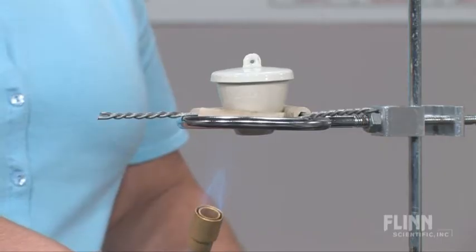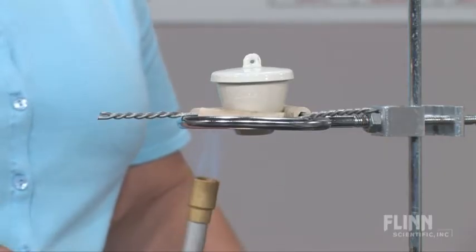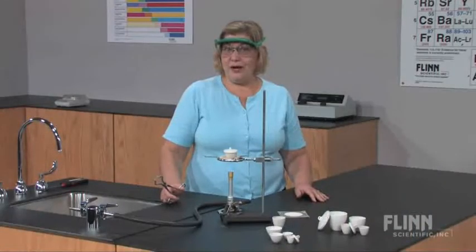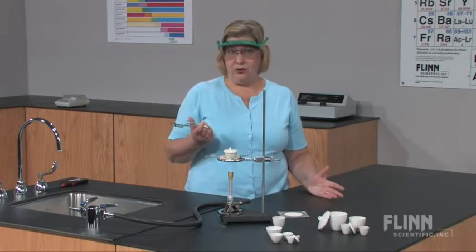Slowly brush the bottom of the crucible with a flame for three minutes before placing the crucible in the hottest part of the flame. Avoid touching, handling, or removing the crucible cover with cold tongs.